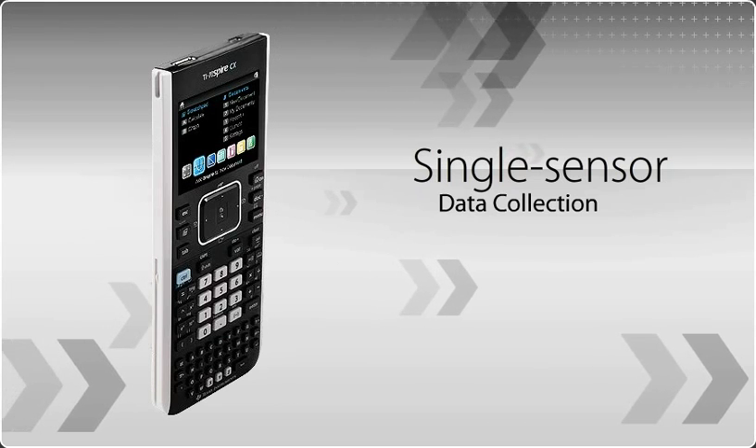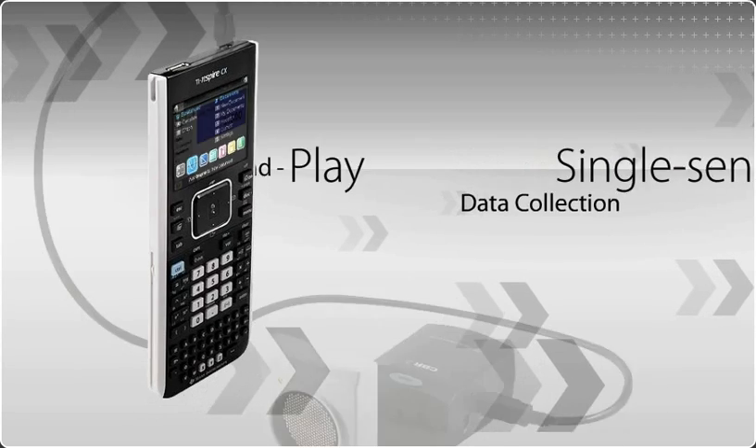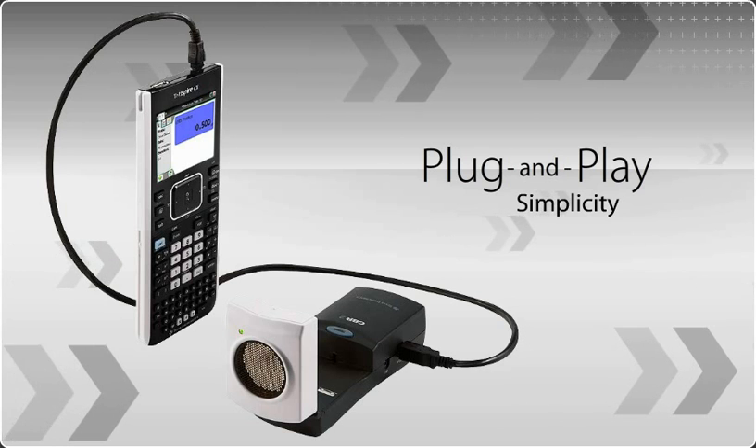Spark your students' curiosity with single-sensor data collection to gather and analyze data easily, quickly, and accurately. Just plug and play. The TI-Inspire CX handheld instantly turns into a powerful data collection device.